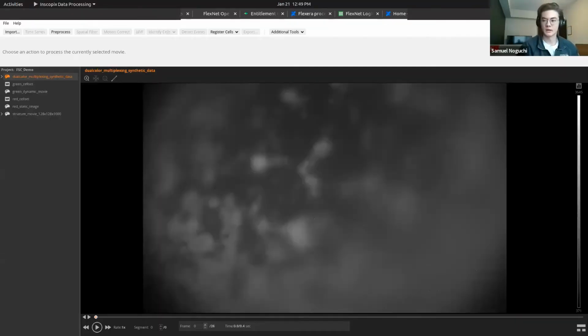Okay, so hi everybody. As Shay mentioned, my name's Sam, and I'm a University of Waterloo engineering intern here at Inscopix this term. I started at the beginning of January with the IDPS team, or the data product team, and I'm working mostly on the IDPS product. During the beginning of my term, for the first week or two, I was responsible for implementing a new tool in IDPS, which is going to be used by users to measure lines in movies or single frame images. So everyone can see my IDPS screen, right?